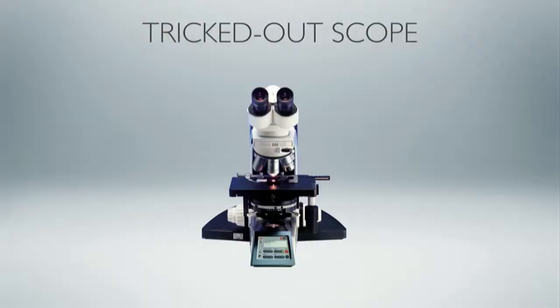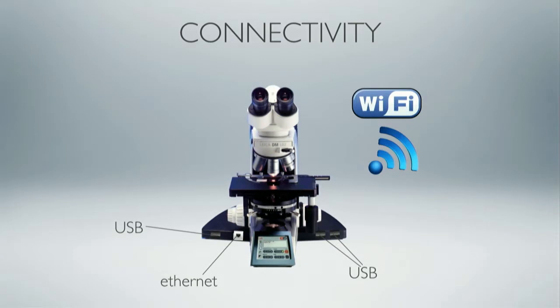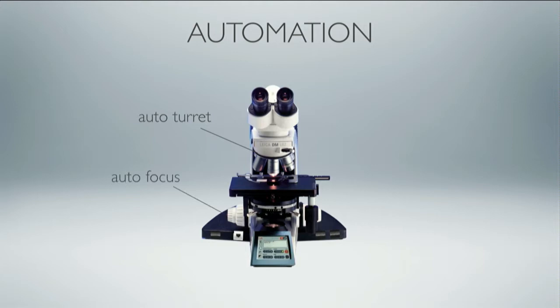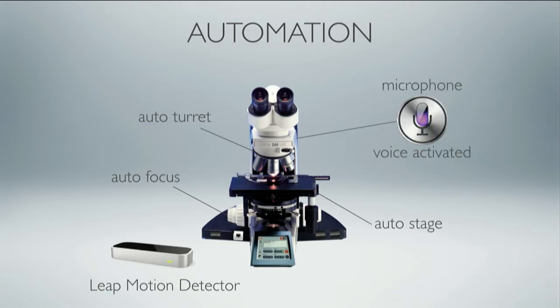So looking at microscopes alone, you could have a tricked out microscope which has USB connections. You always need a few of those for charging things, and an Ethernet and Wi-Fi connected microscope. There could be automation. It's a hassle to turn the turret, so that could be an automatic push button. You could have autofocus, obviously, auto stage, a motion detector to move the turrets.